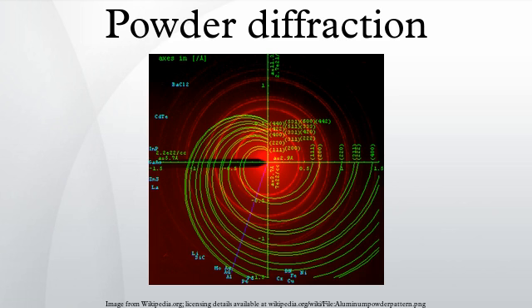The method has been historically used for the identification and classification of minerals, but it can be used for any materials, even amorphous ones, so long as a suitable reference pattern is known or can be constructed. Phase identification: the most widespread use of powder diffraction is in the identification and characterization of crystalline solids, each of which produces a distinctive diffraction pattern. Both the positions and the relative intensity of the lines in a diffraction pattern are indicative of a particular phase and material, providing a fingerprint for comparison.